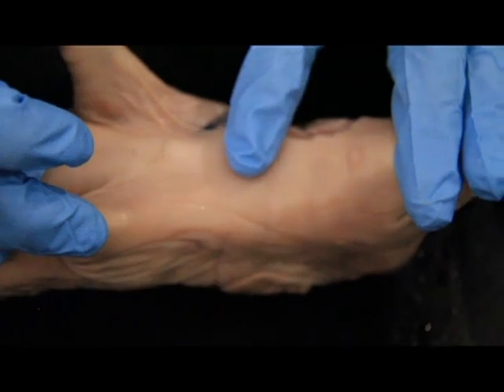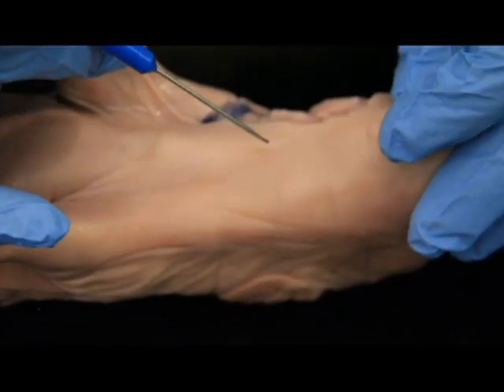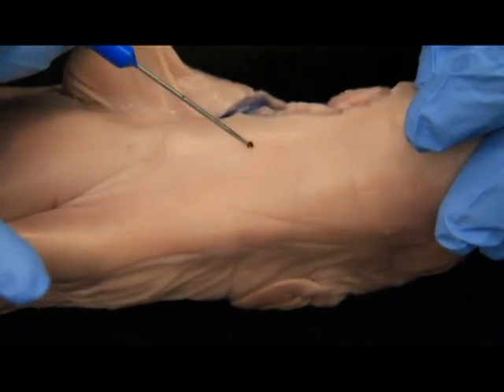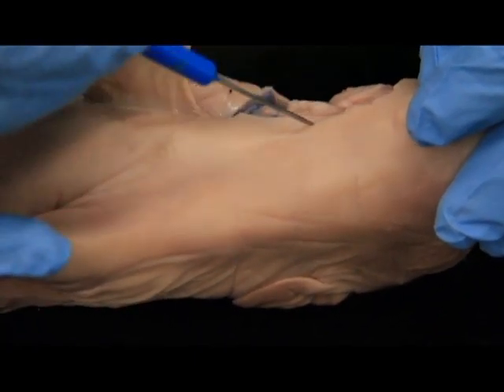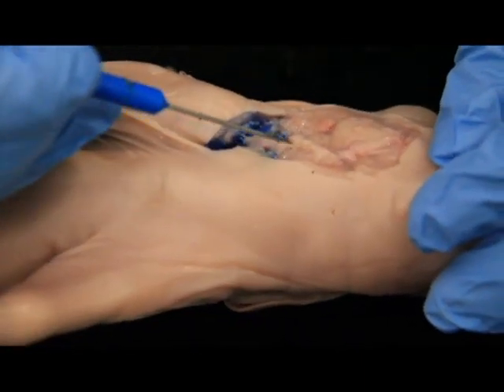And that ball in the throat, that's actually your larynx. So you're going to be able to cut all the way down until you hit that ball. And then don't cut the ball away, but you're going to want to cut around that and down into the trachea. But don't worry about all of this material in here. There's a lot to go, so make sure you work your way from here over. And now I'm going to show you guys what that looks like.